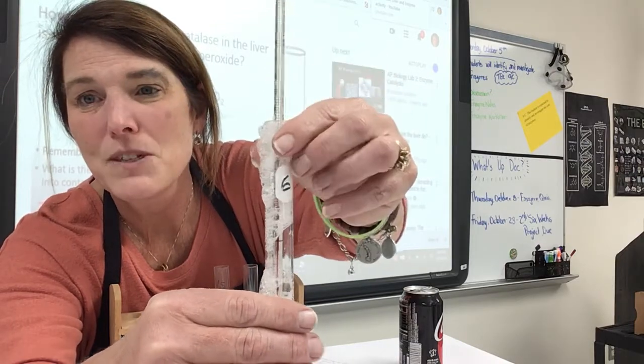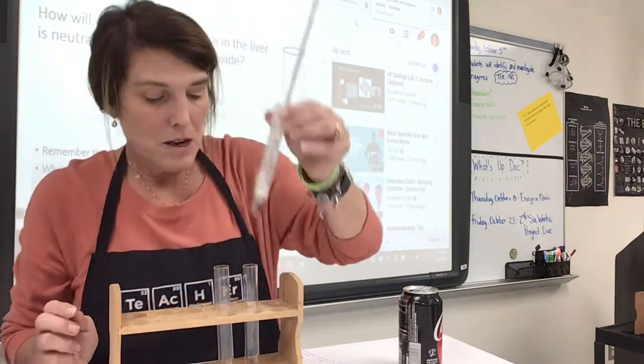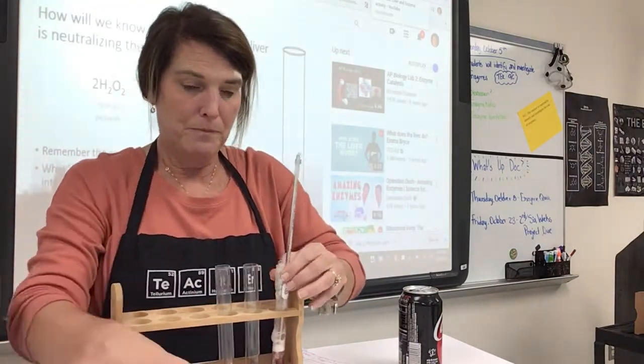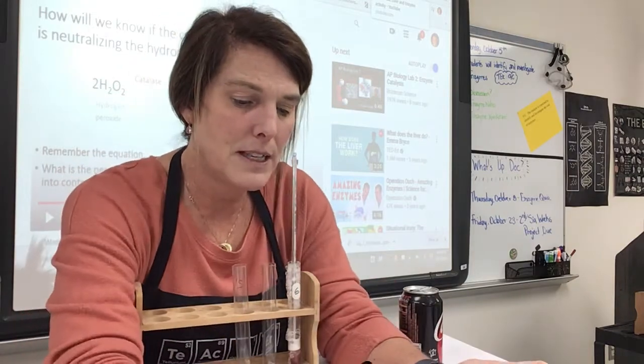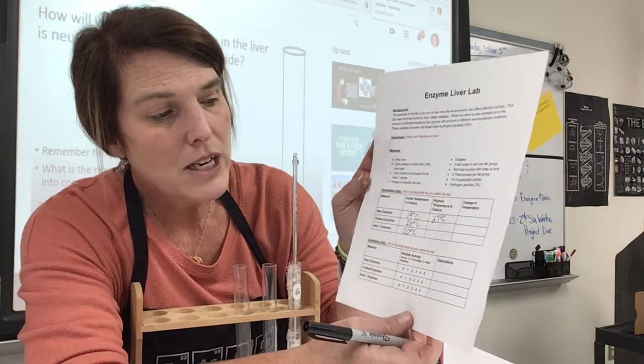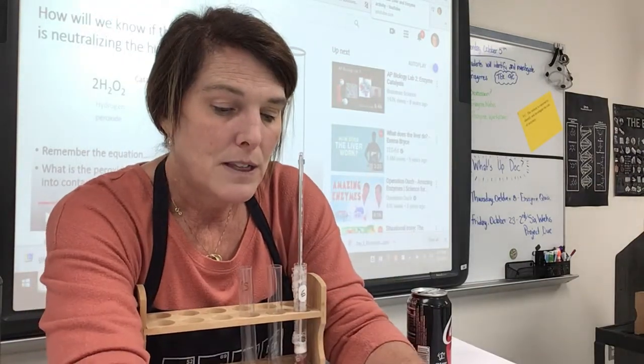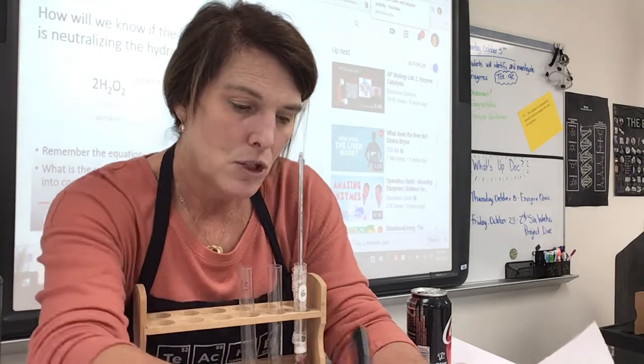Okay, the highest temperature, and it kind of stopped going up, was 27 degrees. So highest temperature in Celsius, 27 degrees Celsius. So what is that change in temperature? 27 minus 19. I'll let you guys figure that change in temperature out.